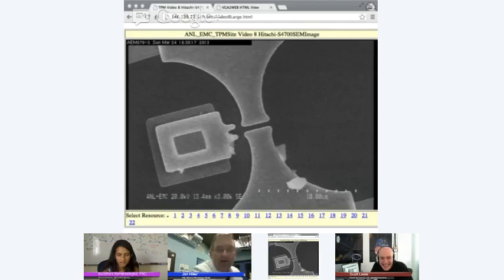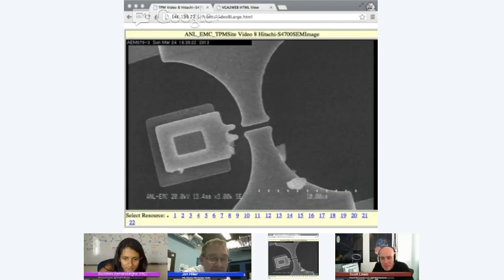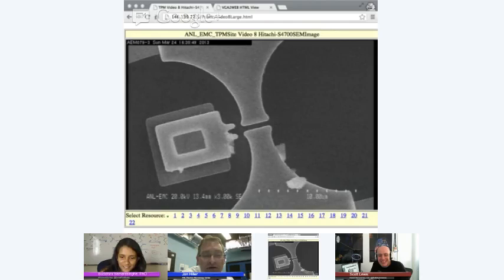What's the other stuff on that image? It kind of looks like debris. Is it debris? That is debris, yes. So do you have to clean it before using? How does maintenance work for something like this, where a dust particle is like a football? It's because we have taken it out of its clean room environment, and just putting it over here, we've contaminated it. You don't want those things on there. They're not good because they add some mass to it. It affects your measurements, yes. Is there anything you do to bring it back to a sterile condition? No. Once it's contaminated, it's no longer a device that we can use.